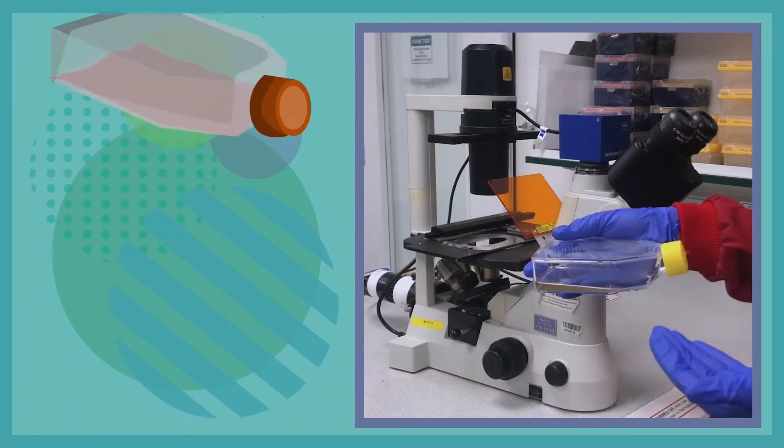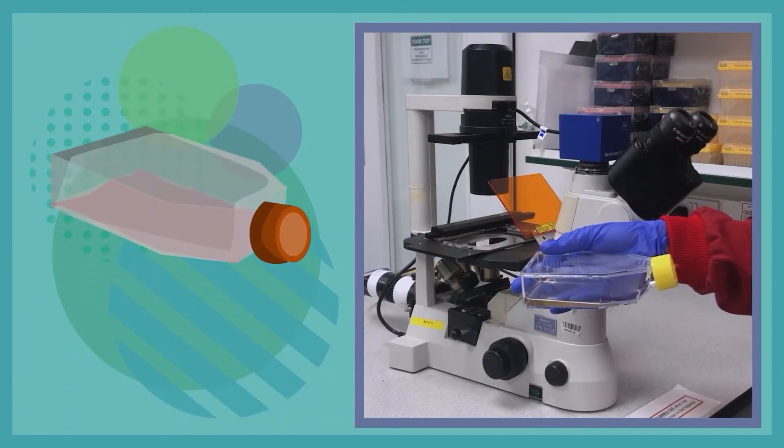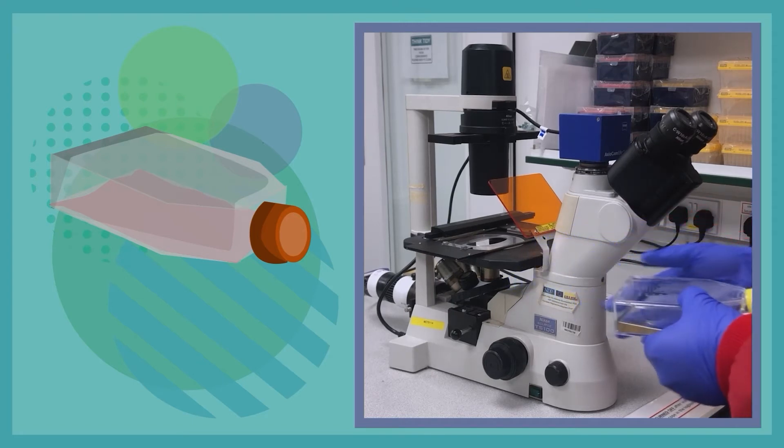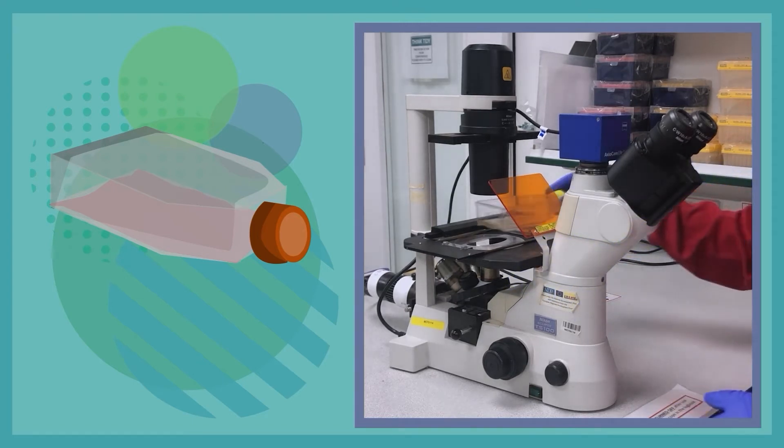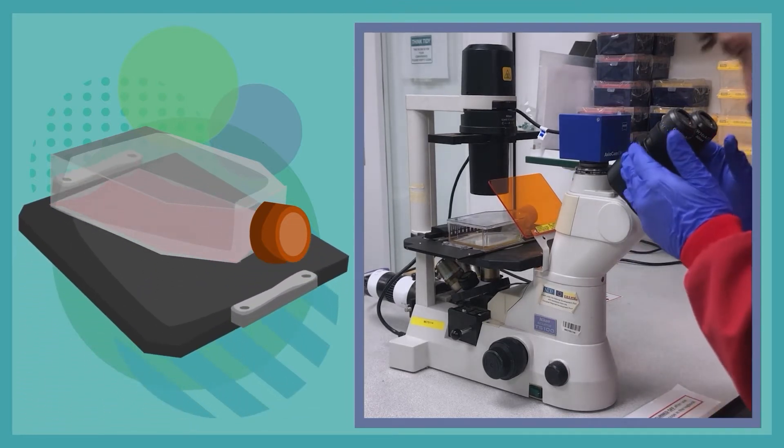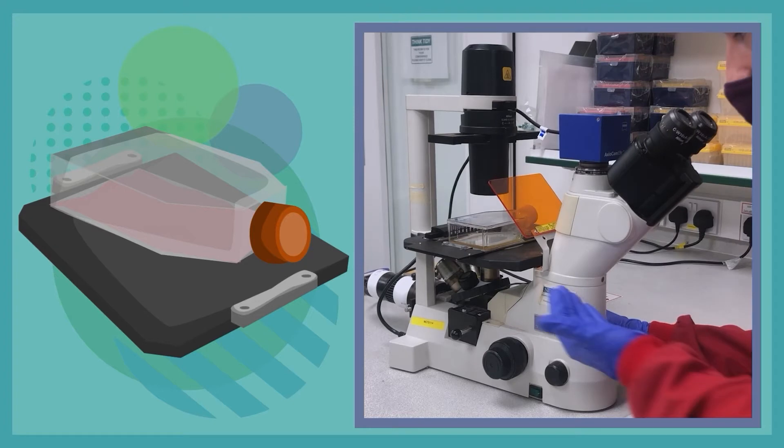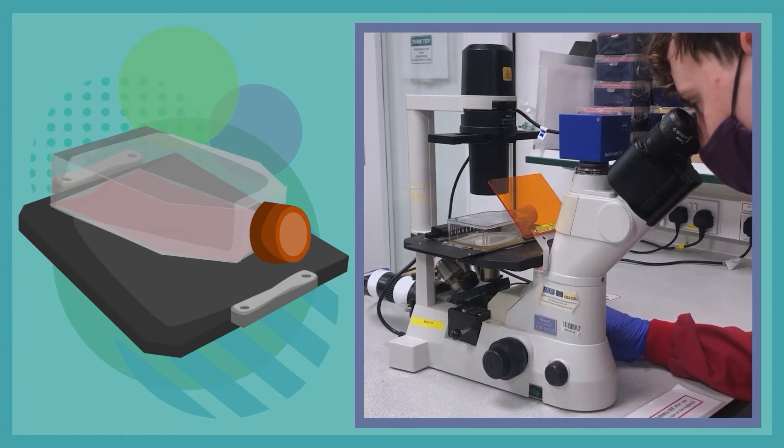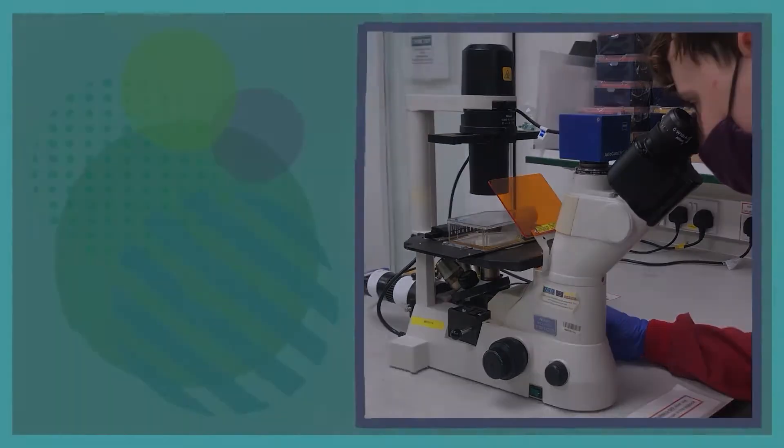Here we have a flask of central nervous system support cells known as astrocytes. To mount onto the microscope, you gently place the flask on the stage between the clips. You can then look down the eyepieces to see your sample, bringing them into focus before bringing them up on your computer screen.